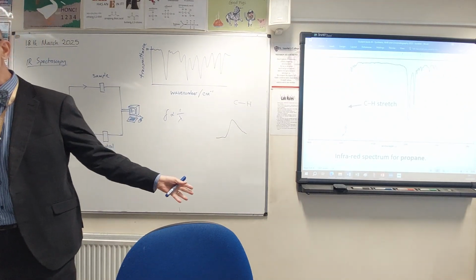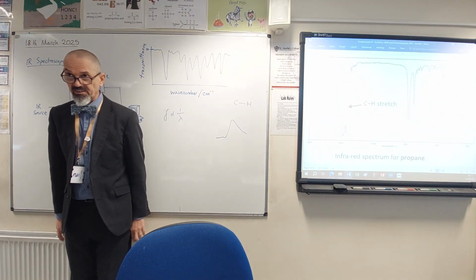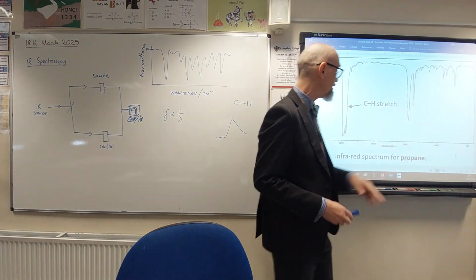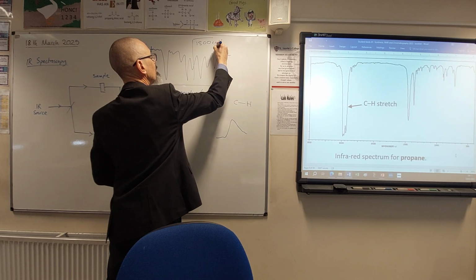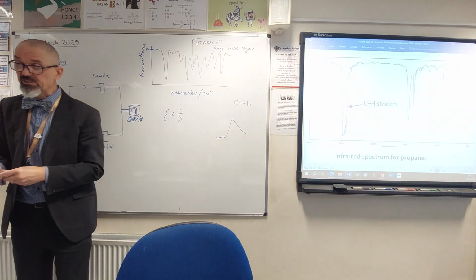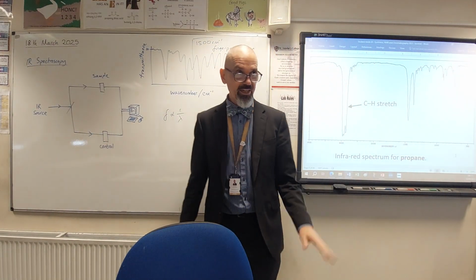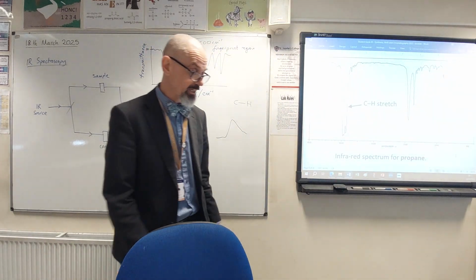Okay, so propane's a pretty simple substance. It's got some carbon-carbon bonds and some carbon-hydrogen bonds. That's it. Some of those bonds are going to be absorbing infrared light down there, but below 1500 centimeters to the -1, we call that the fingerprint region, because we'll often get a specific pattern of peaks for a specific compound. So rather than going to the laborious work of finding every single peak, we can simply look it up in a database and it'll recognize that pattern and say, yeah, that's propane. So in other words, using it as a standard fingerprint.